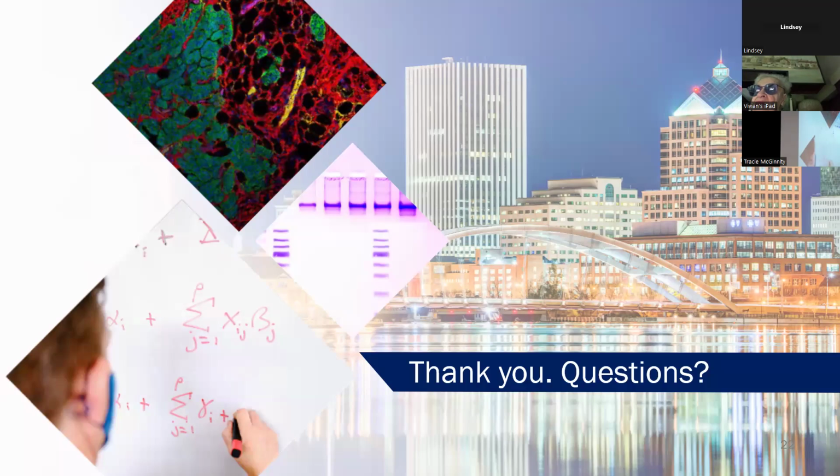Thanks. So when you look at the analysis, what services are provided, and is it only compatible with data that you're already collecting before? Like you mentioned a lot, spatial transcriptomics and epigenomics and stuff like that. What if you have proteomics and metabolomics that you want to compare, things that you might not be as well versed in? Yeah, great question.